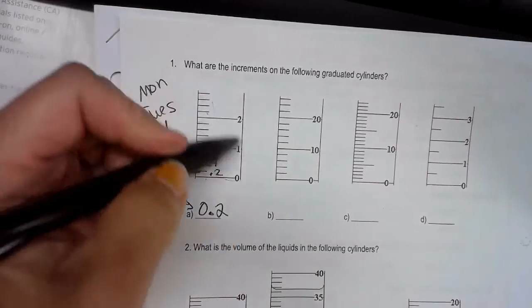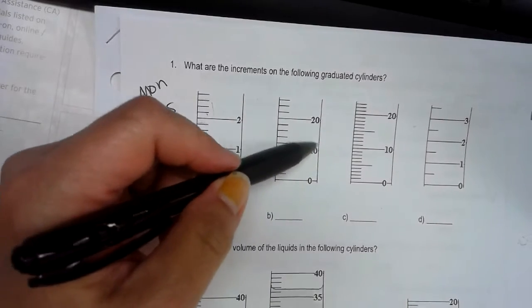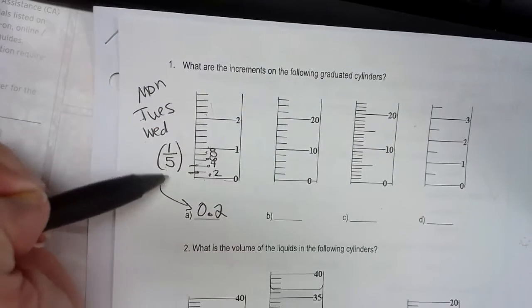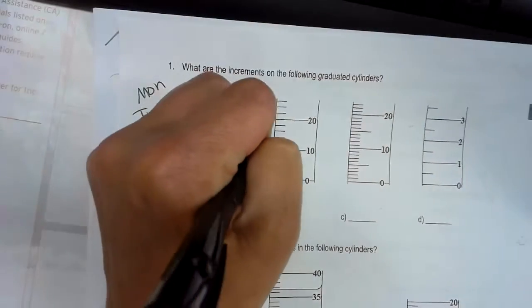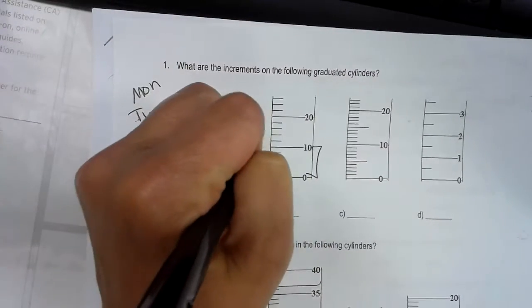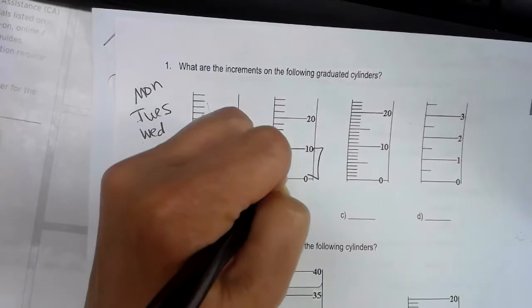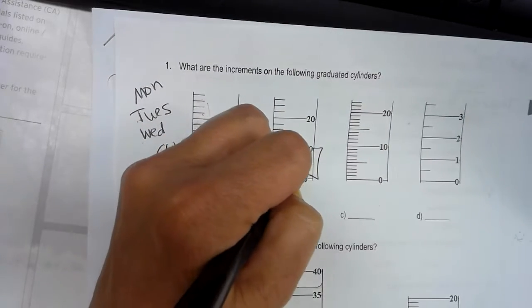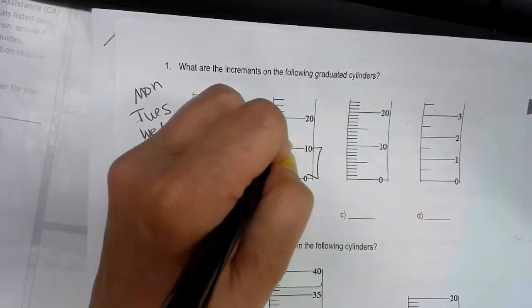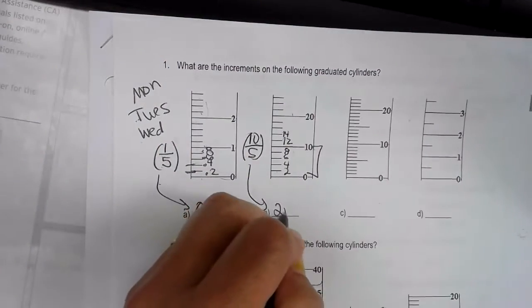Okay? If we do a very similar thing with only having 5 lines, but it's 10 to 0, 20 to 10. So instead of having 1 over 5, we're going to have 10 volume units over 5 lines, and that reduces down to having each one being 2. This is 2, 4, 6, 8 mils. This is 12, 14, and so forth, all the way up to 20. So this would be 2 mils.